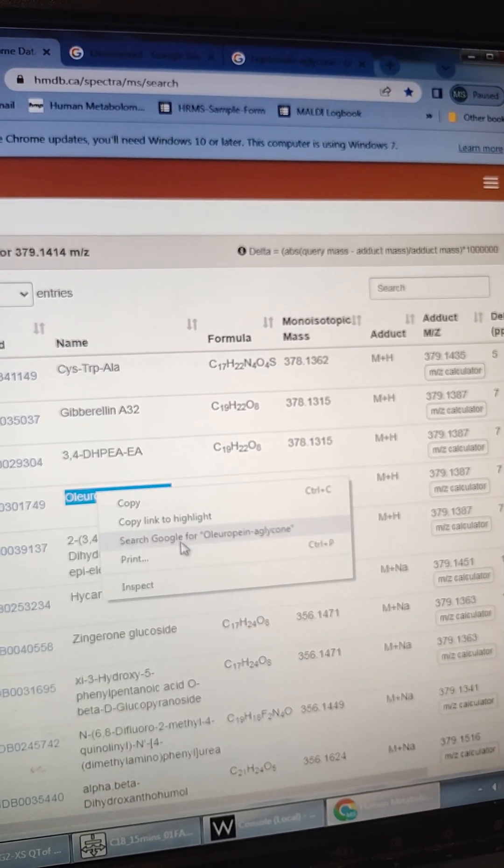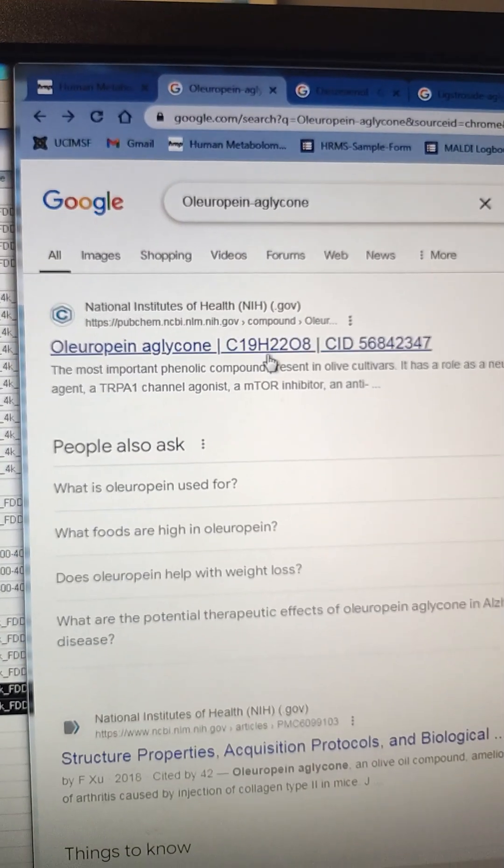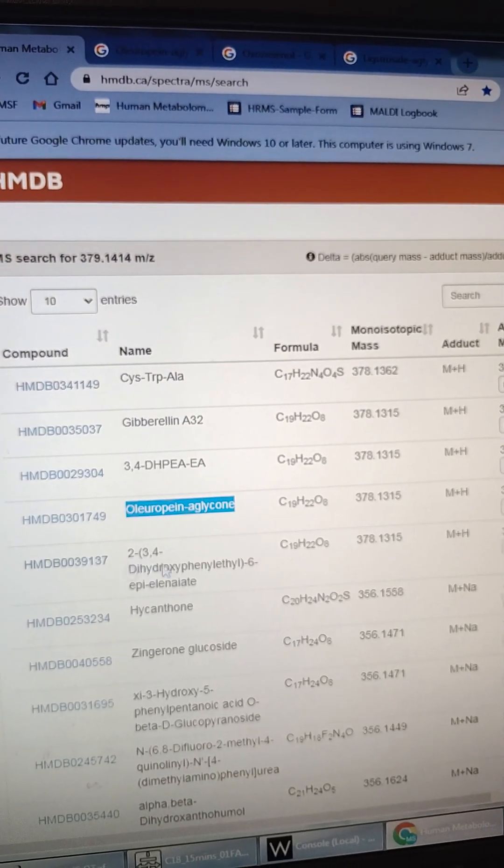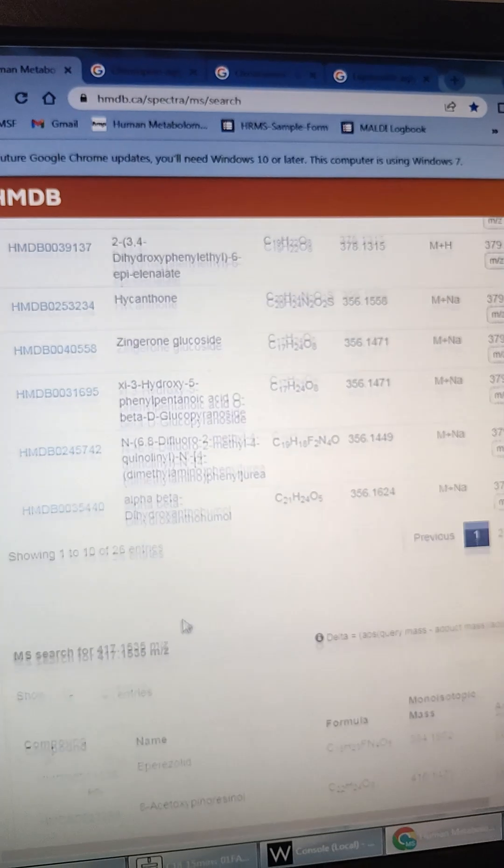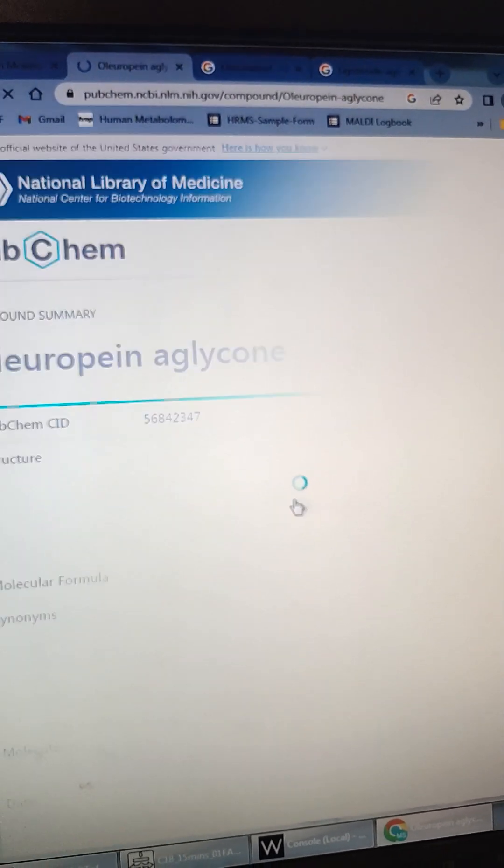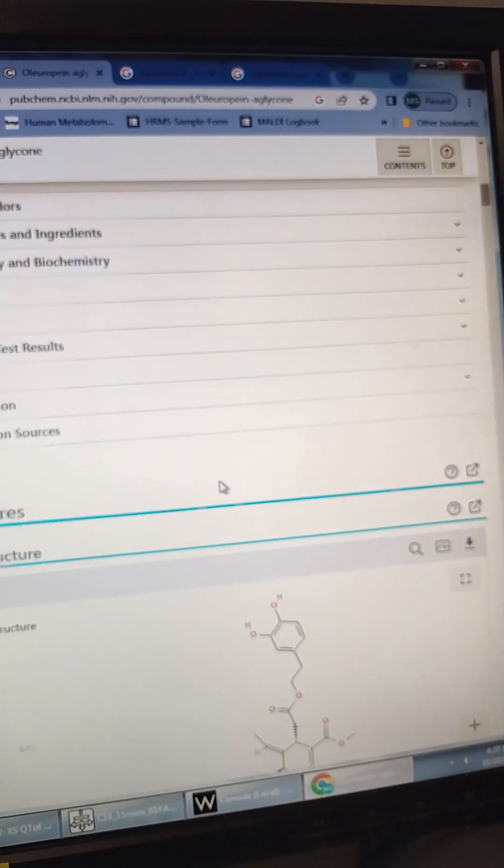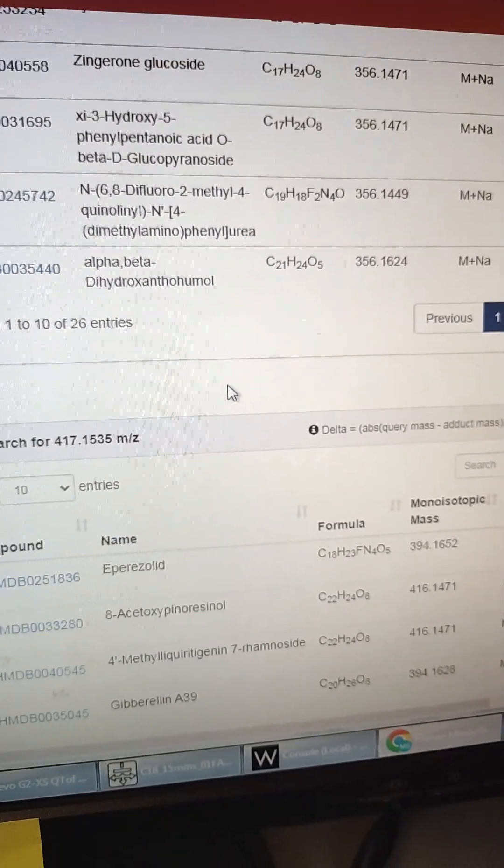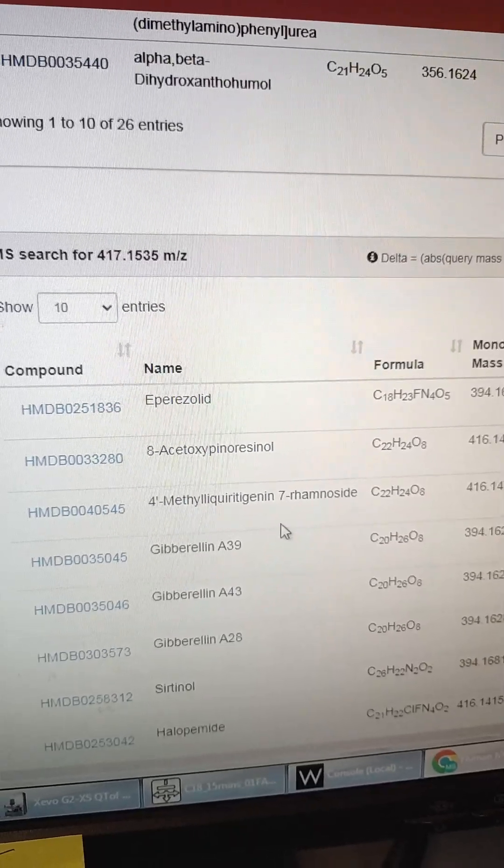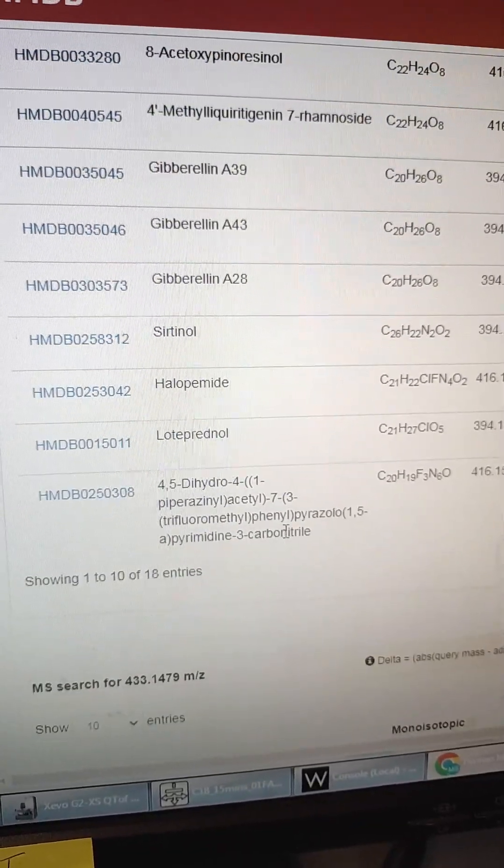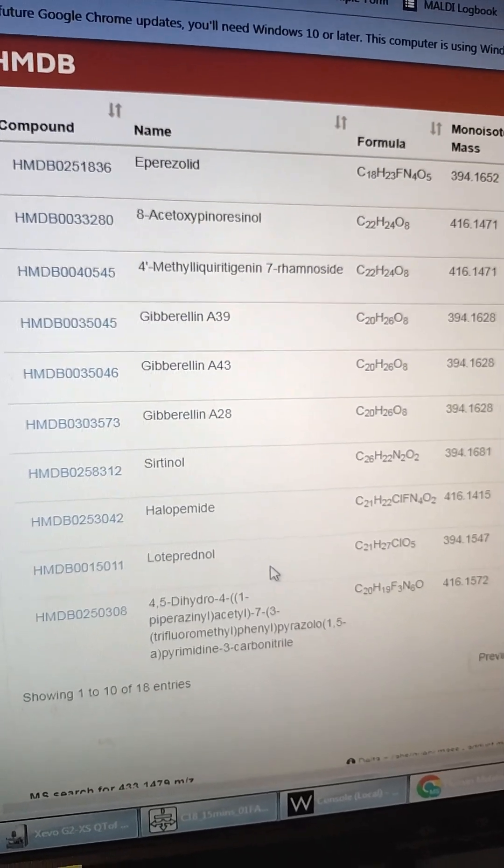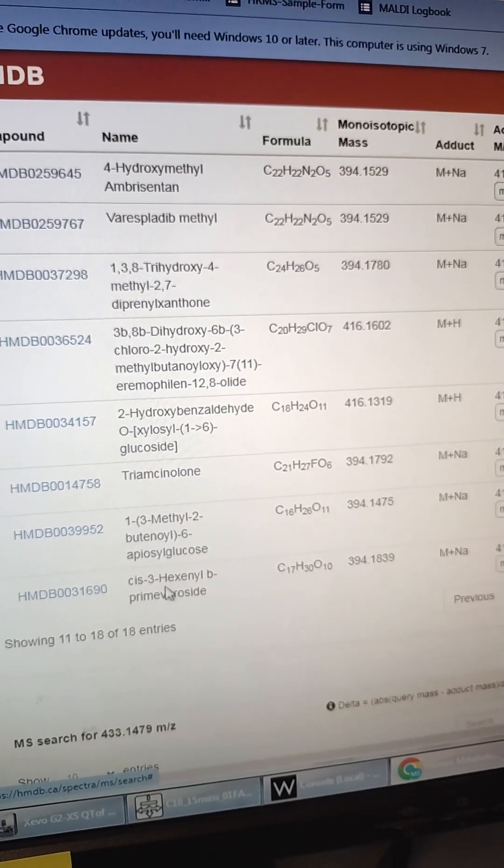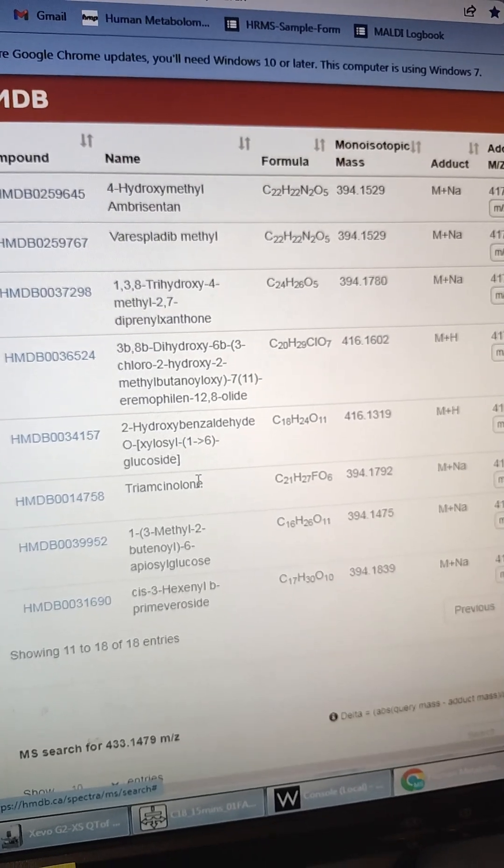379. Another olive oil aglycon peak. This is what these things kind of look like. These polyphenolics. As you can see, not a lipid. Really cool. That's why we're seeing them early, because they are not lipids. They're phenolics. So again, we keep hitting gibberellins. I'm thinking maybe there's some hormone carryover from spraying these olives. They're using gibberellins to spray fruit, so it does kind of make sense. And those would carry through. But again, got to send through untargeted to confirm all this stuff.